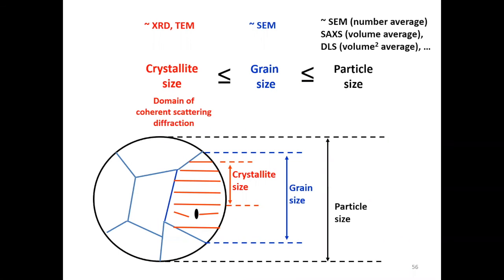There is also another thing: how come I'm getting different density or size? Well, you have to understand that XRD does a large average in your material, where some of these techniques are more local and they average in volume versus, or they average in number. So keep that in mind when you compare across techniques, across labs.